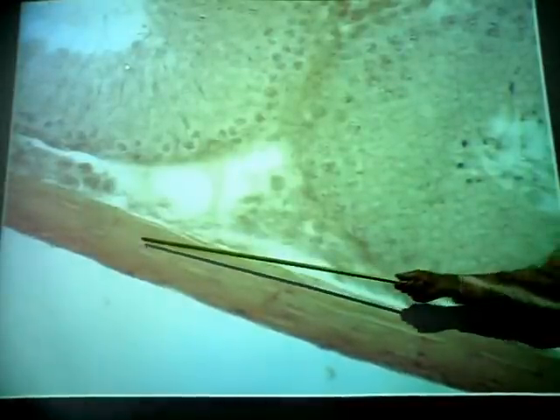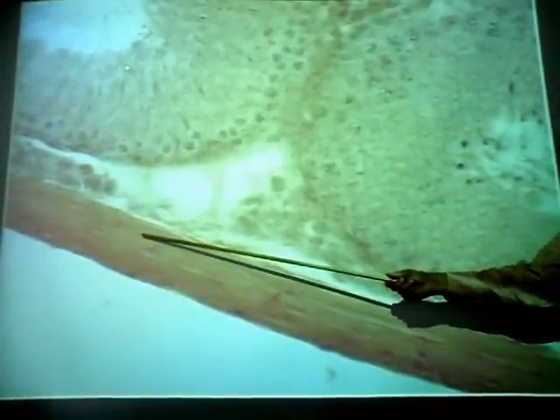Okay? Something else you should recognize, and that's this connective tissue membrane that surrounds the organ. It's found in many organs. What is this? That's the capsule. It has a fancy name. It's called the tunica albuginea. The tunica albuginea, which also is the same name applied to the capsule around the ovary. Tunica albuginea. Connective tissue membrane surrounding and protecting the organ.